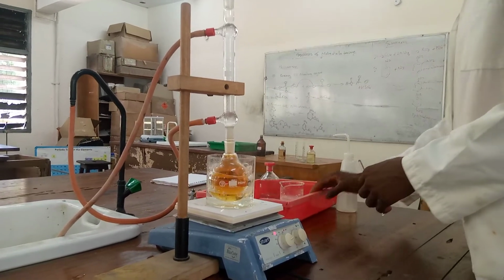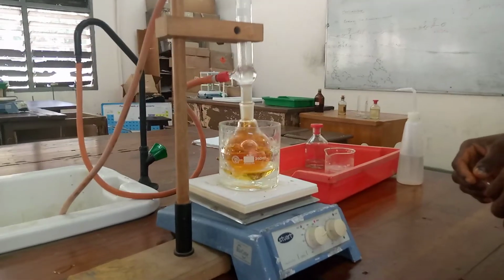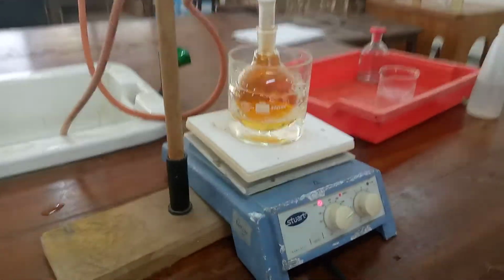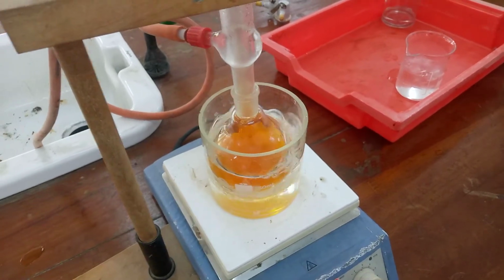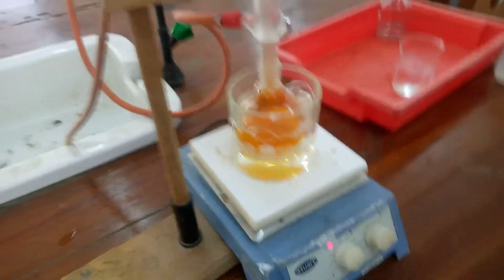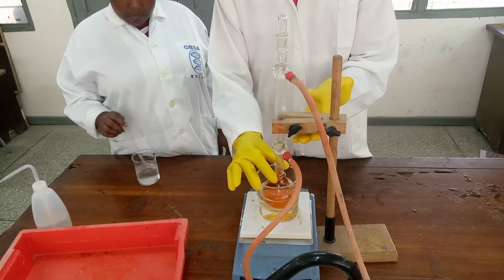Alright. So you can see the brownish nature of the gas inside the flask. This is a signal that our reaction is complete. Our reaction is complete. Alright, so our reaction is complete.